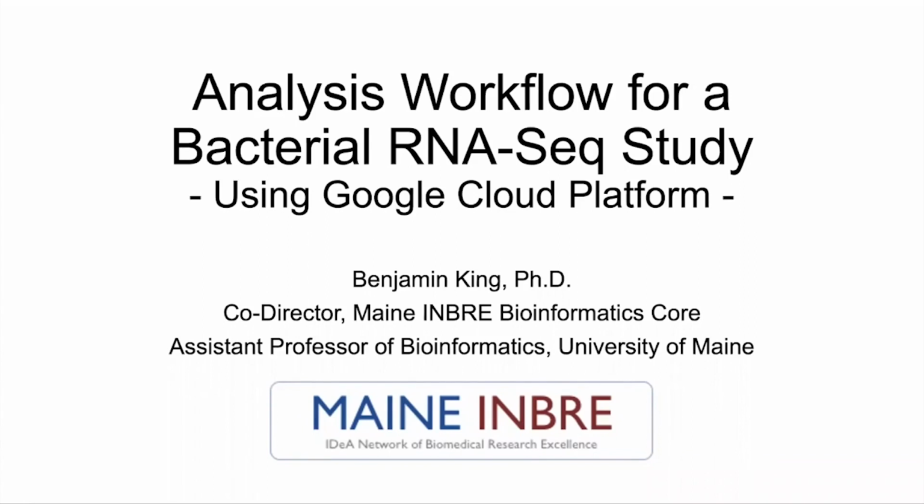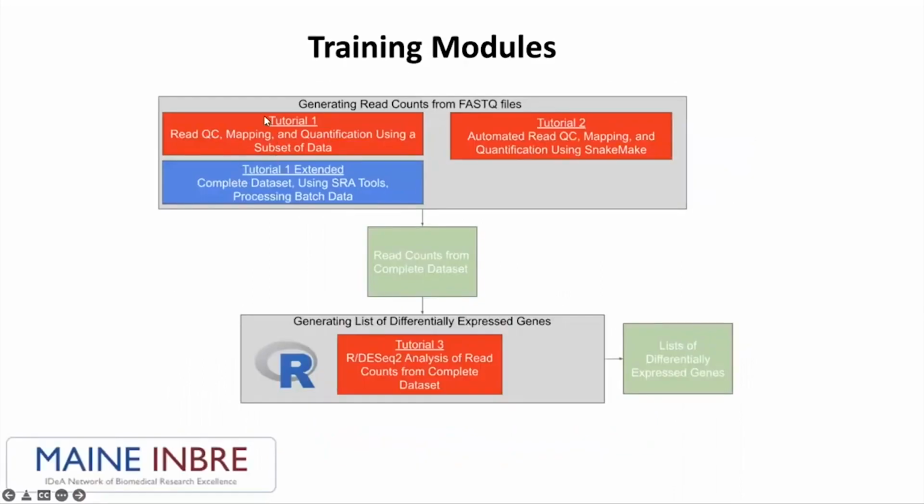As part of this, we will be featuring the Google Cloud Platform as a commercial computing environment. There are a set of 3 tutorials that we will review, 2 of them in additional videos. And this video is going to be featuring tutorial 1, where we will be analyzing a subset of data from a bacterial RNA sequencing study.